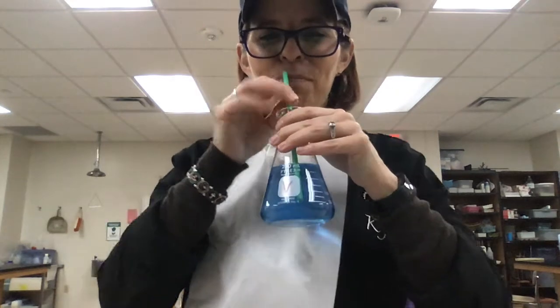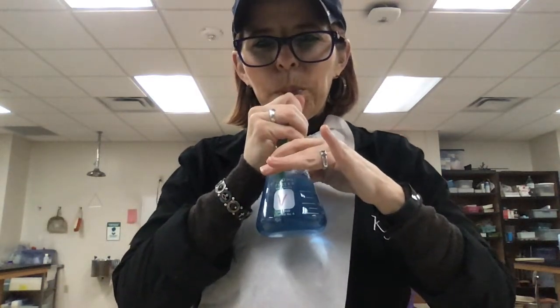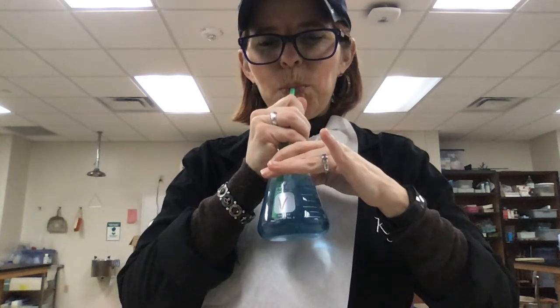Okay, so you can see the blue. It's going to take me a moment. Feel free to speed up. Oh, it's not taking that long. Can you see the color changing?